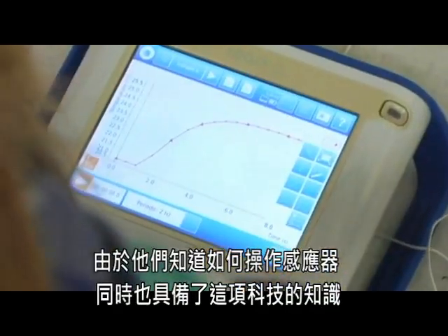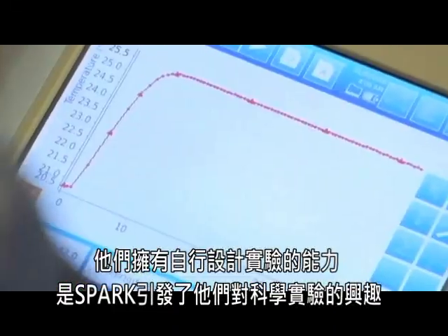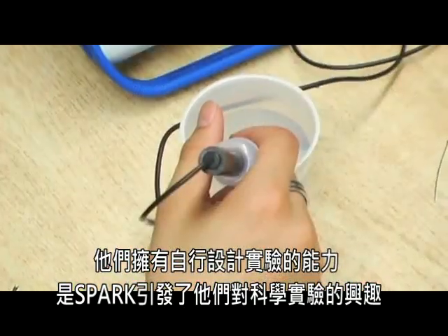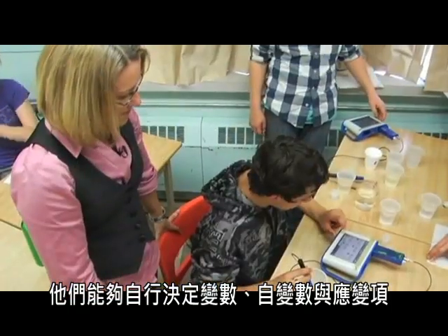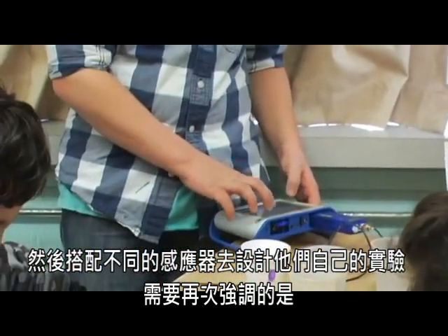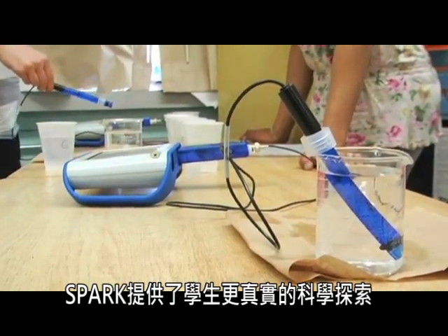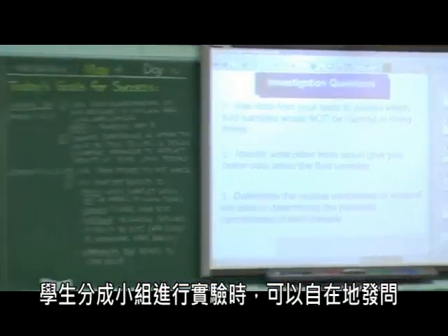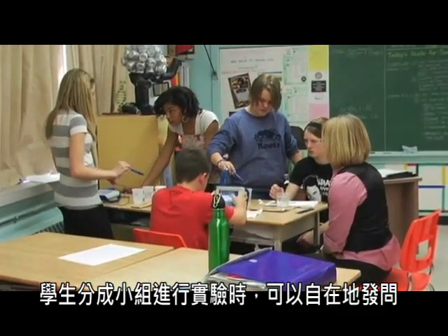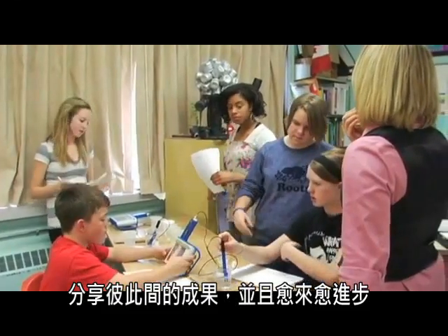Because they understand the probes, because they understand how to use the technology, they are very able to design experiments on their own. The students are given something that tweaks their interests. They determine variables, independent and dependent variables, and then design their own experiments around the probeware. And again, it creates a more authentic scientific inquiry. When we see these students in small groups, that's when they feel comfortable to ask you questions and to share their answers and to go beyond.